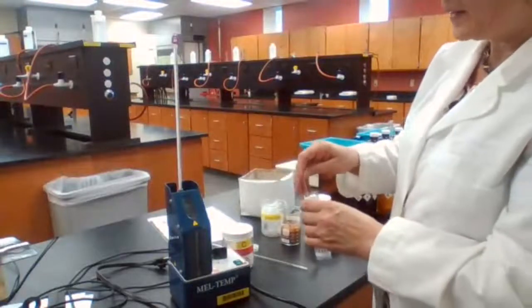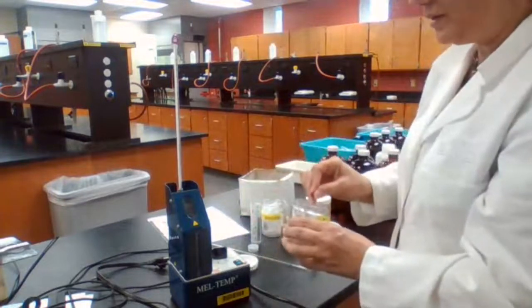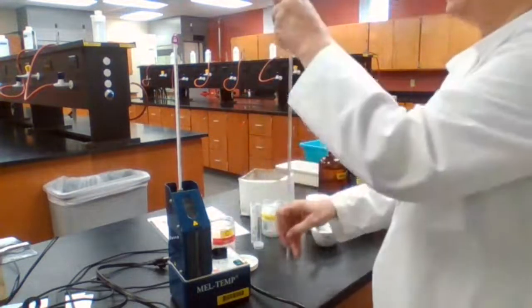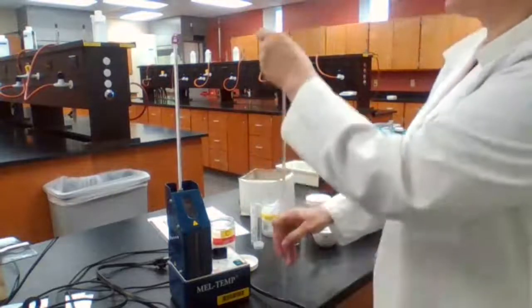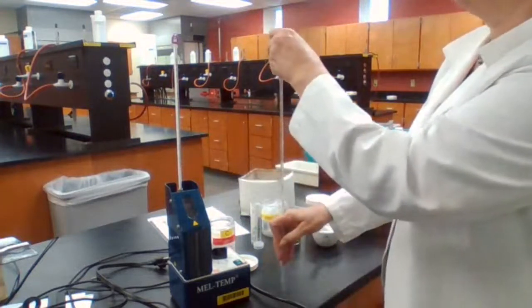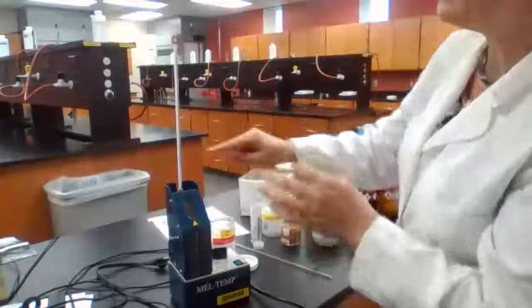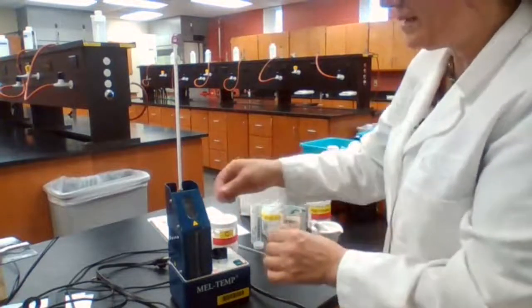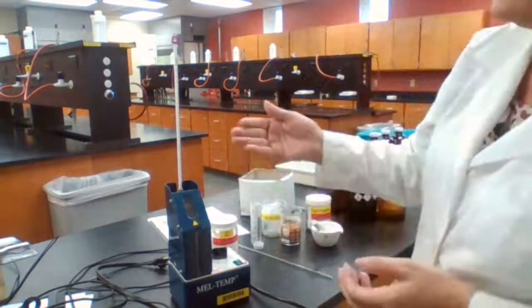Prepare a new sample. I'm going to prepare a new sample for unknown. I don't know the name of the unknown yet, but I will look at it later. I prepare a new sample for the unknown and wait until the temperature drops to 70 degrees. So in case this compound melts at around 80, it doesn't melt right away, because right now it's showing like 95. So I cannot place it in there yet.